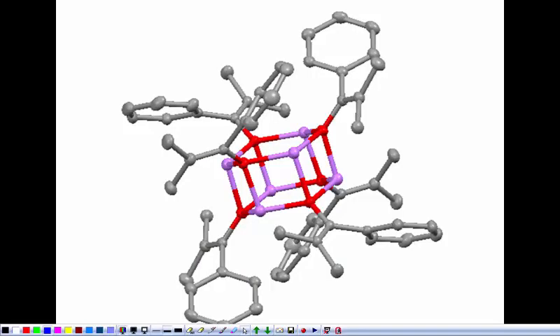Now, X-ray crystallography is not just for organic molecules, but it gives you something like this, the exact structure. This is one from an undergraduate research student that worked with me. These are the organic parts. You can see they're 6-membered rings, those are benzene rings. And then you've got a carbon-carbon double bond here because you can see the molecule's planar. And then there's some oxygens. There's actually lithiums in here. But you can get the exact 3-dimensional structure of the molecule from X-ray crystallography.